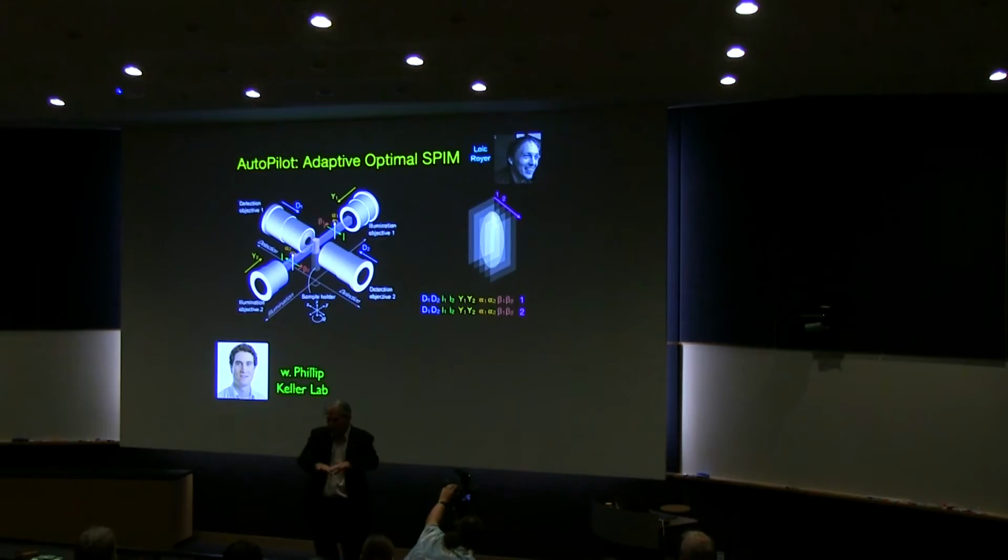And then they would have to come in every 4 hours in the middle of the night to basically make sure that it hadn't gone off, and readjust the parameters. But what were they basing the parameters on? I mean, they have no idea what the light's doing when it interacts with a sample. Until you turn the microscope on, you have no idea. So your adjustments are kind of a guess anyway, okay?